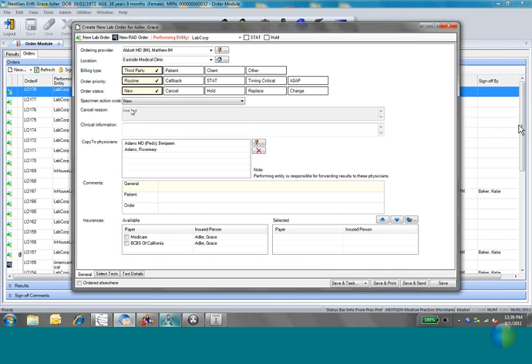All right, so you've also got a specimen action code. And this actually means if you obtain the specimen, you might say if it's a new specimen. Here's the option if the lab does obtain the specimen from the patient, but you might have something else like it's a pending order. You haven't sent the specimen to the lab yet. It could be even all the way down at the bottom. You're adding tests to an existing specimen that they already have. So these are for specifically those of you that collect the specimen or what you're doing with the specimen. It defaults to new, by the way, because it's oftentimes going to be a new specimen.